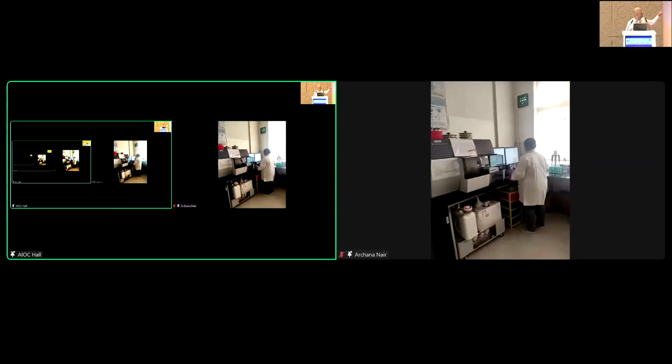Flow cytometry is a cell's facial recognition technology, you can say. So what you see there is a flow cytometer, and she is currently using a tear sample which is being analyzed using a process called bead-based multiplex ELISA. This is a 2-day process, at least one whole day goes in this and another day of analysis. And this is the device, and what you see to the right side is the acquisition. Every cytokine gets measured like that before it forms a dot or a bar in your graph.